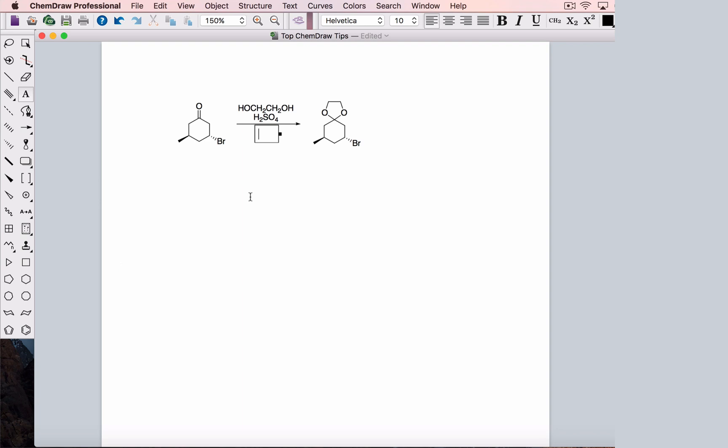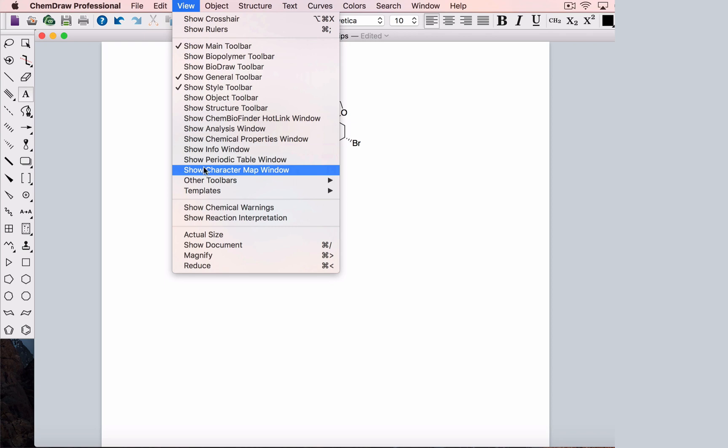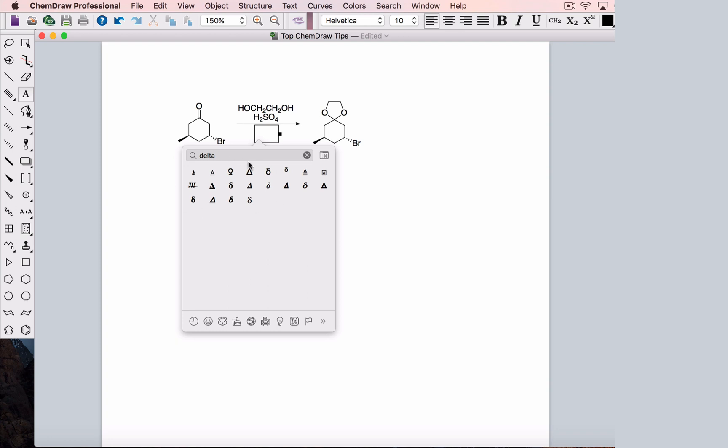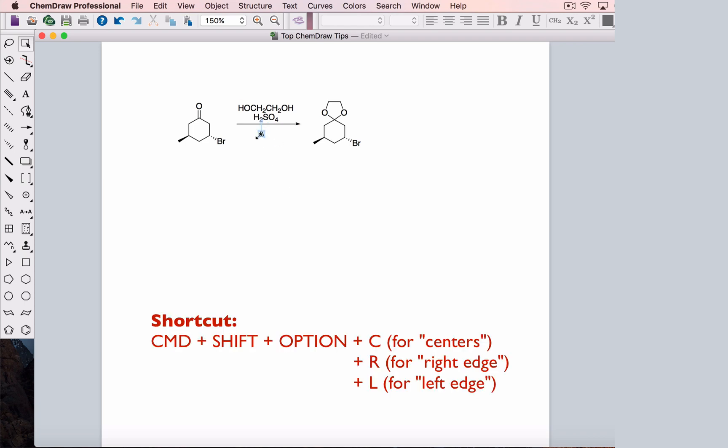Let's say you heated this reaction and your PI wants you to use the delta symbol to show that. From the View menu, select the character map window. Apparently you can even add emojis in this version of ChemDraw. We'll type delta and a variety of representations for the character pop up to choose from. Finally, we need to align the arrow with the text. Select the three objects and align the centers.